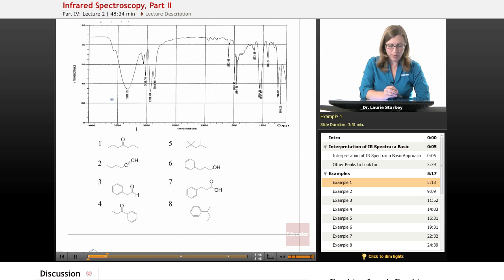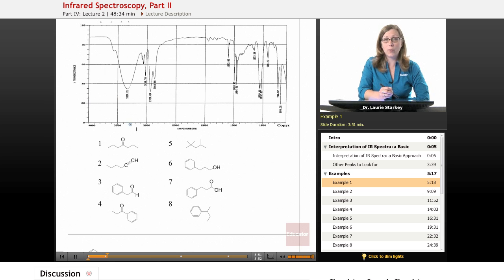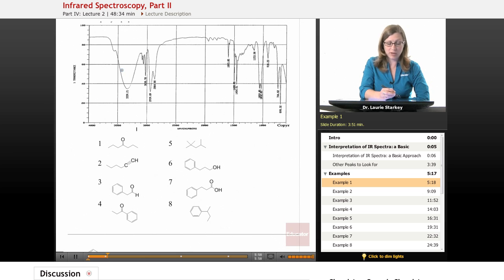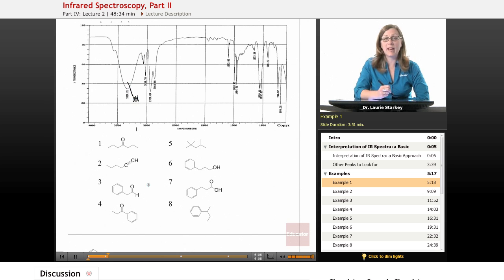We start by looking around 3300, which is where we find an alcohol — an OH. Do we have an OH here? We sure do. This big broad peak around 3300 is exactly what an OH looks like. So we can point to it, circle it, and label it clearly. Get into the habit of labeling your spectra.